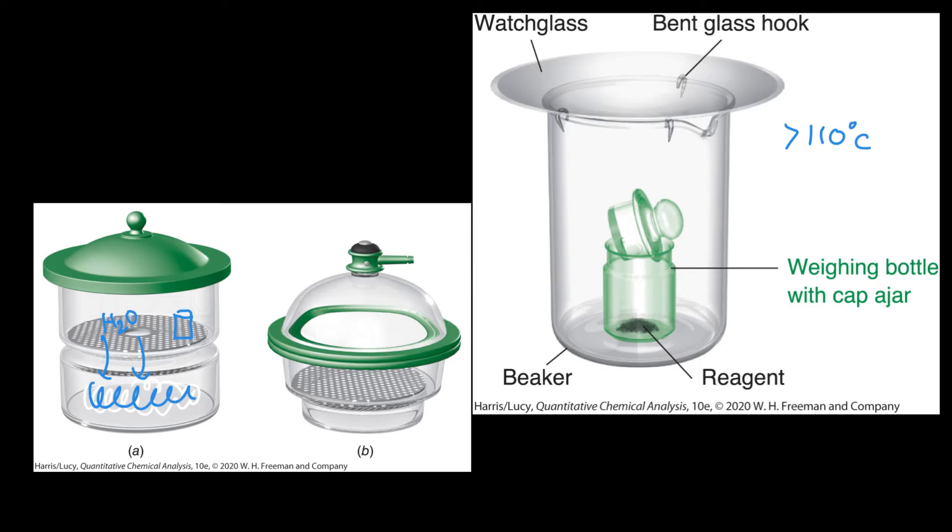The difference with a vacuum desiccator is that we actually remove the air using a vacuum pump. Then as we turn this top valve around, the little air hose can actually close and maintain a vacuum inside.